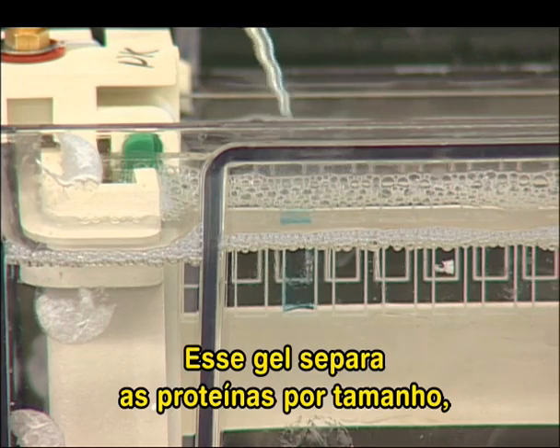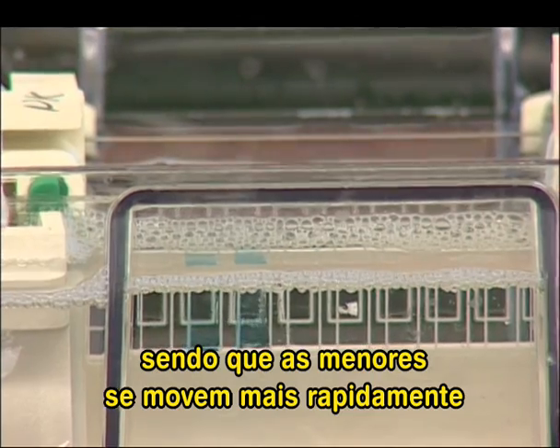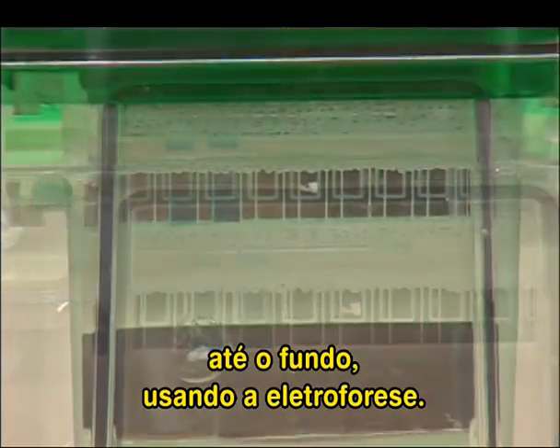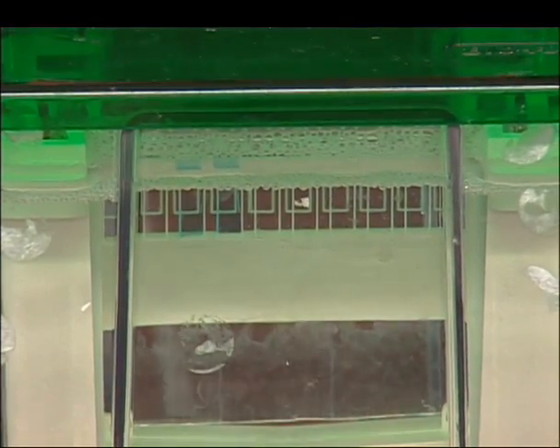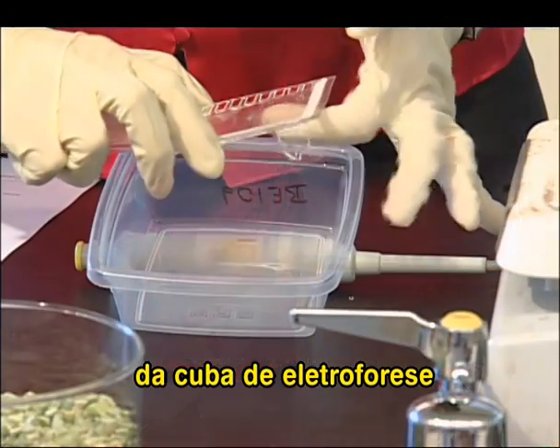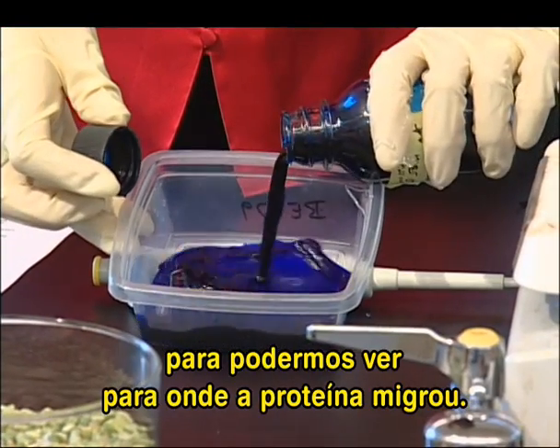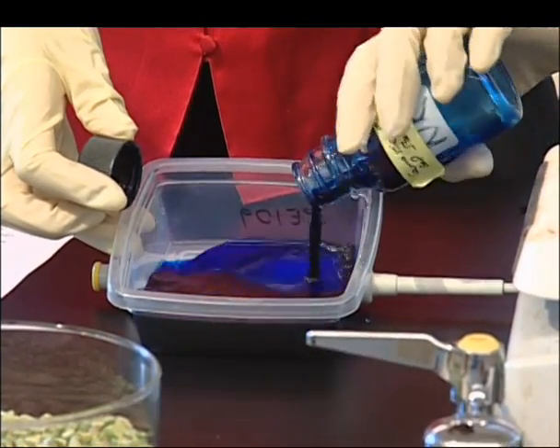The protein gel separates the proteins by size, with the smallest proteins moving fastest through the gel and to the bottom using electrophoresis. And in the last step, we remove the gel from the electrophoresis chamber and mix it with a dye, Coomassie stain, that will let us see where the proteins have moved through the gel.